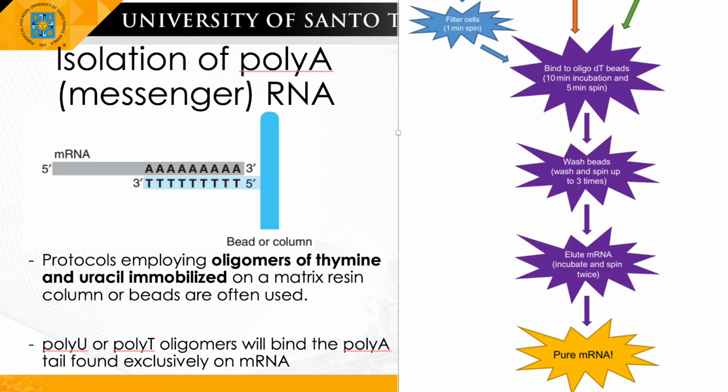Okay, so there are 2 methods commonly used in the selection of polyadenosine RNA: column chromatography on oligo-dT columns and batch chromatography. Column chromatography is normally used for the purification of large quantities, like greater than 25 micrograms of polyadenosine-positive RNA isolated from mammalian cells, while batch chromatography is the preferred method when working with small amounts, less than 50 micrograms of total mammalian RNA. It can be used when many RNA samples are to be processed.